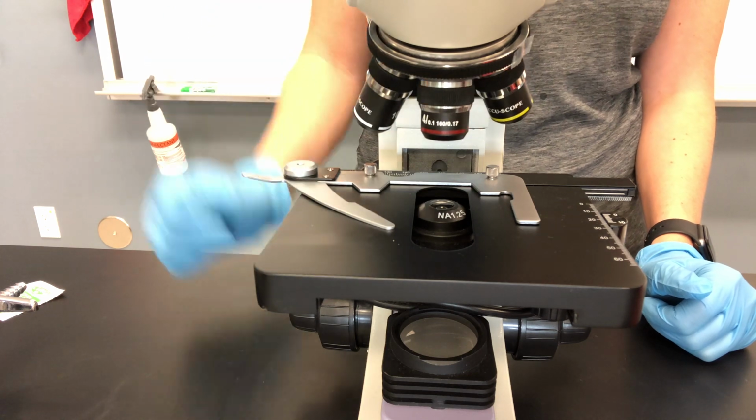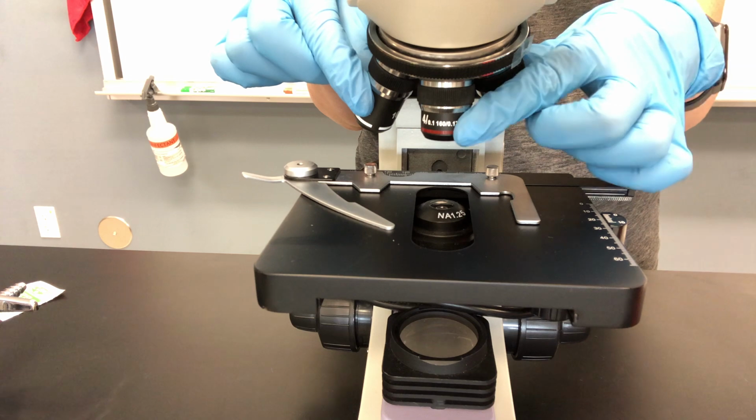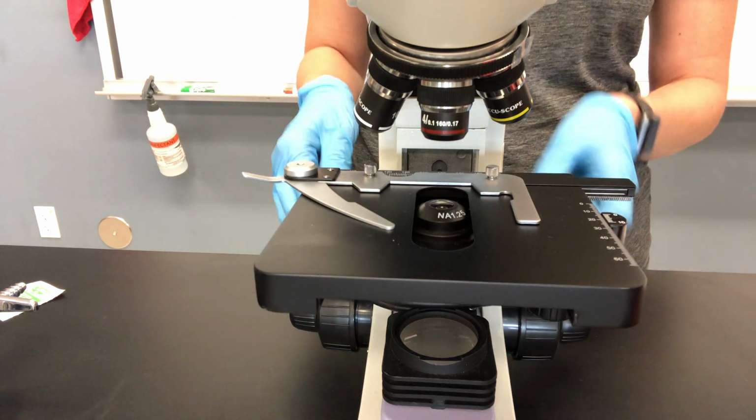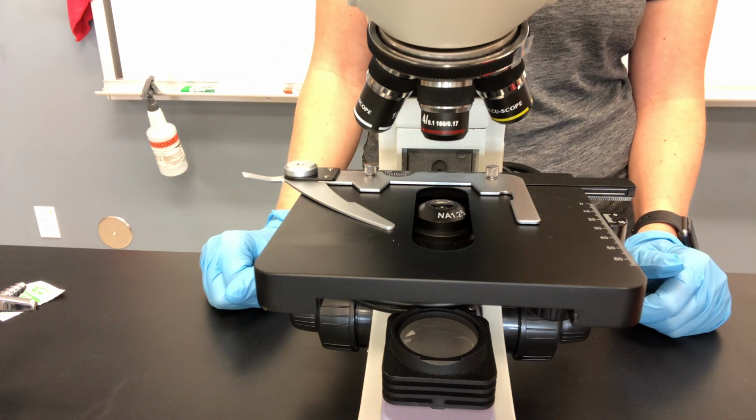When you're ready to put it away completely and you've cleaned the oil immersion lens, click that low scanning power into place, lower the stage all the way down, neatly wrap the cord, and then you can carry the microscope back to its little cubby.